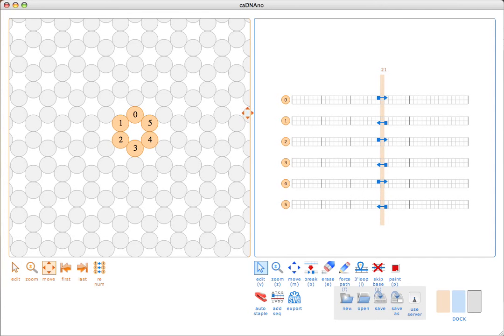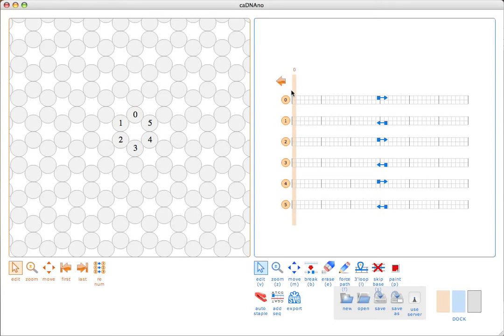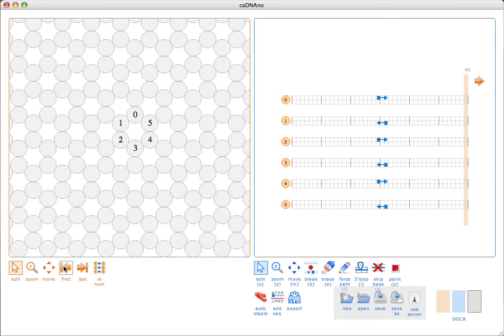The slice panel actually displays and edits information for the currently selected slice in the path panel. While the honeycomb lattice is always fixed in the XY direction, how the helices are highlighted or edited depends on the location of the slice bar in the path panel. When the slice bar is moved to the first or last position, it pops up with a button that gives you the option to extend the grid in the Z direction.